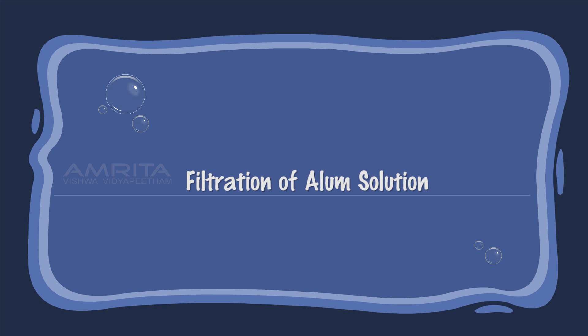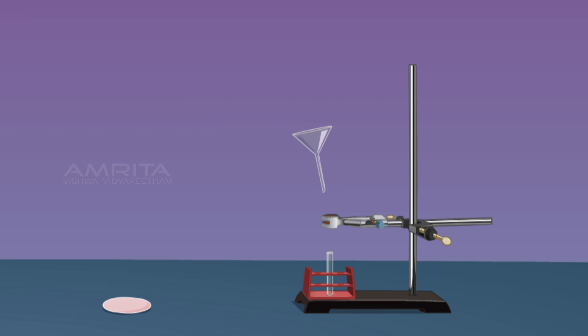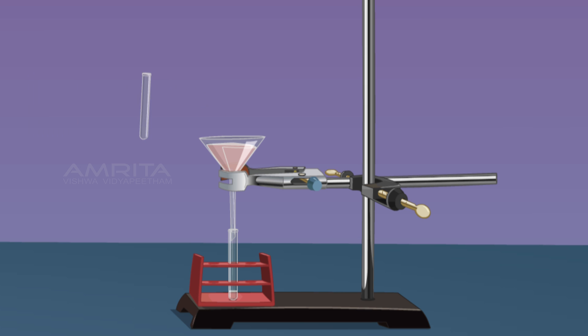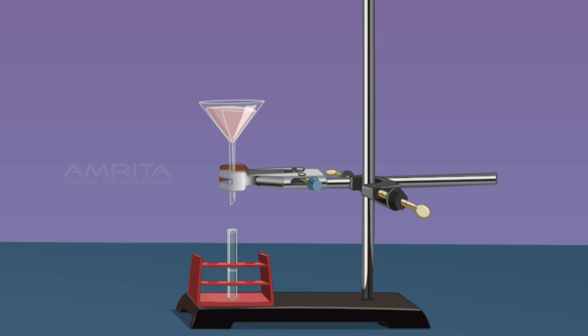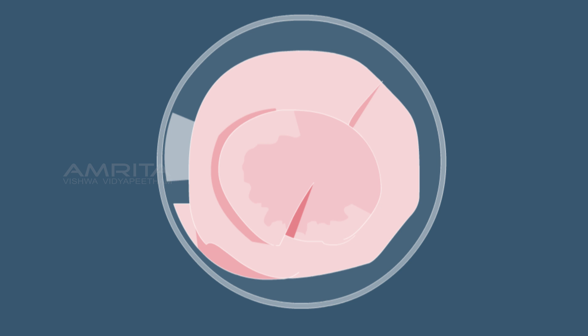Filtration of Alum Solution: Place a funnel over the test tube using a clamp stand, then place a filter paper in the funnel. Now pour some alum solution through the funnel. A clear filtrate is obtained with no residue left on the filter paper. This indicates that solid particles cannot be separated from a true solution by filtration.